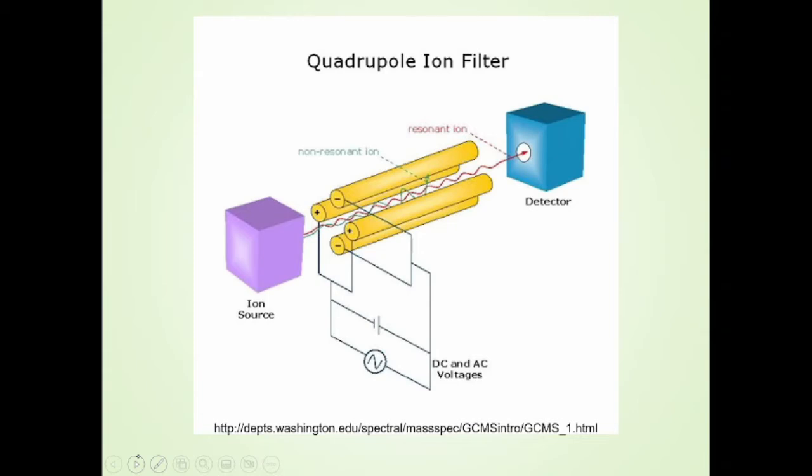And the usual way that it's run is called scan mode. We will tell it scan from 50 AMU to maybe 400 or 500, 800, depending on what mass range you expect. And so if it's sitting at 50, it's looking, are there ions? Yes or no? Move over to 51, and then looks and then moves over again.